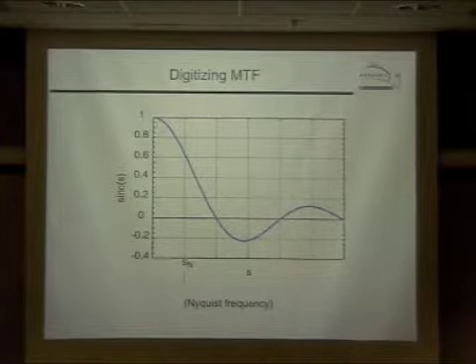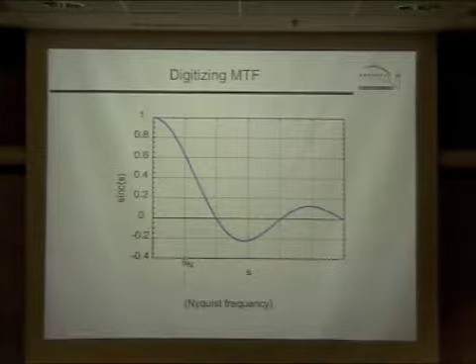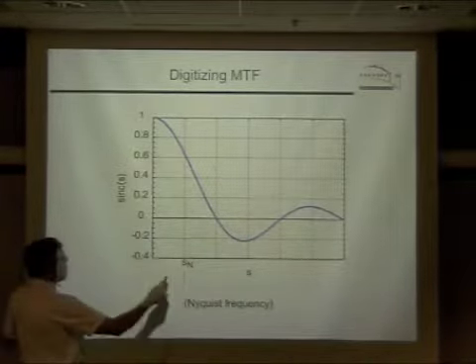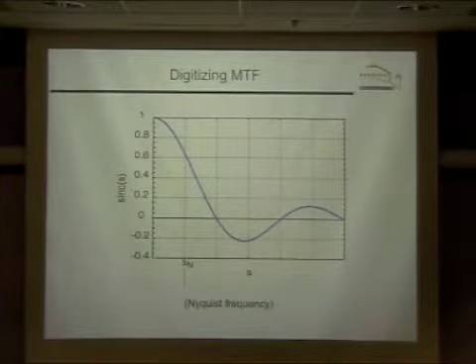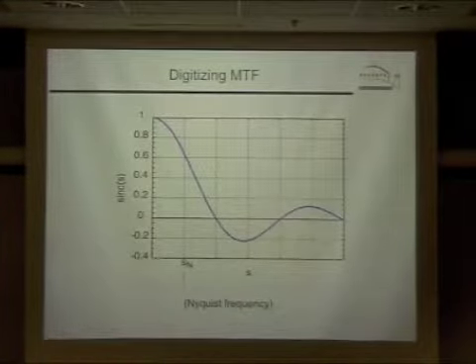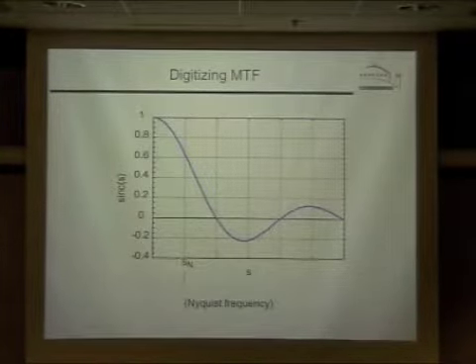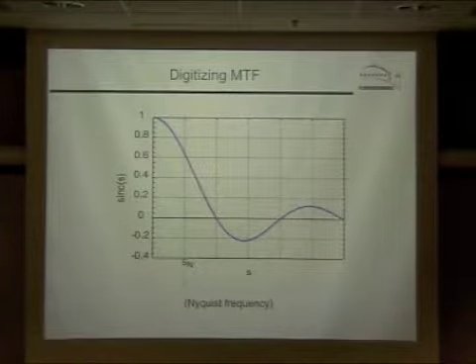And that often happens in real life when there's a lot of noise in the signal at high frequencies that gets folded back, or as we say, aliased back into the part of the signal that you're actually using. So we try to arrange that there is no signal out past the Nyquist frequency, but of course that's not something you can really ever arrange in real life.